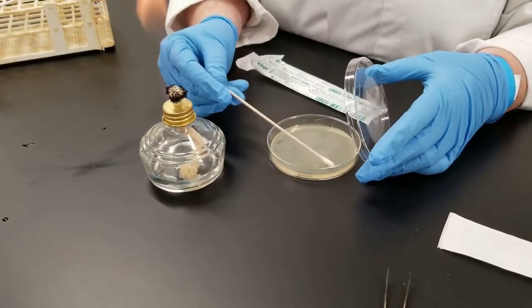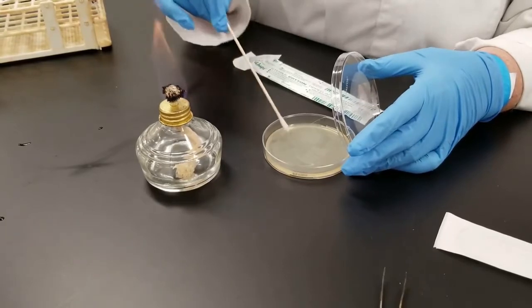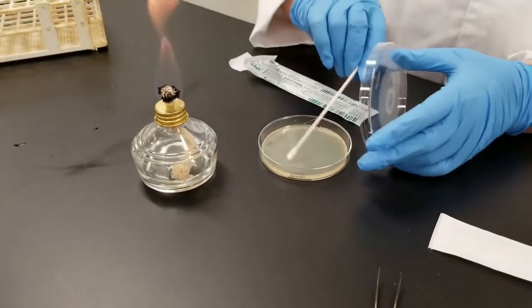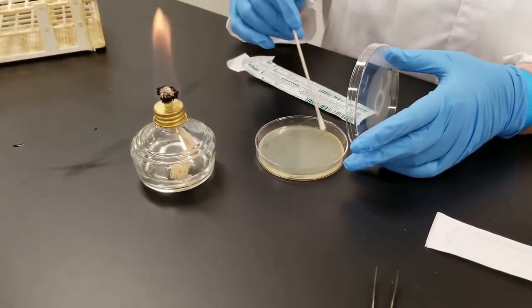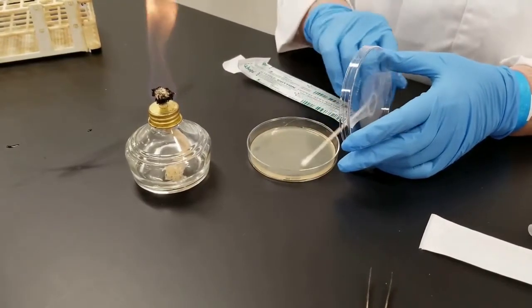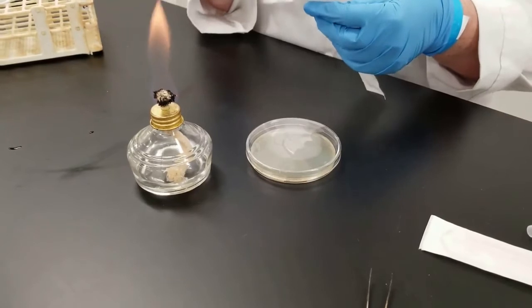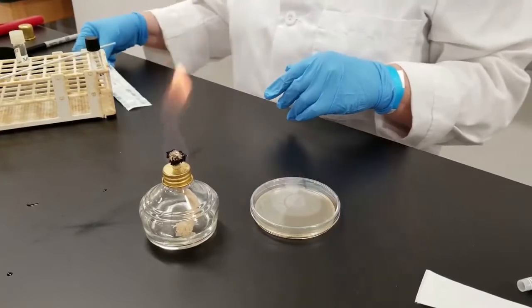On the plate, I want to get nice, solid growth across the entire plate. So the way we're going to do this is just spread the tip of the cotton tip applicator. First you go in one direction, then you go in another. You just want to have complete coverage across this plate. And then at the end you swirl around the plate like this. Once again, you don't want isolated colonies. You want what we call a lawn. It's a complete coverage on the plate. When I'm done with this applicator, I'm going to stick it back into this paper sleeve for disposal into the biohazard container.